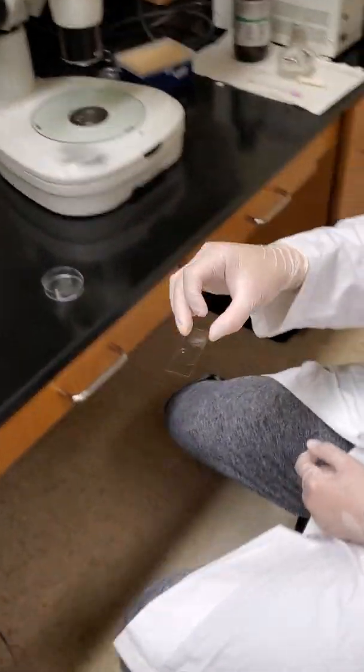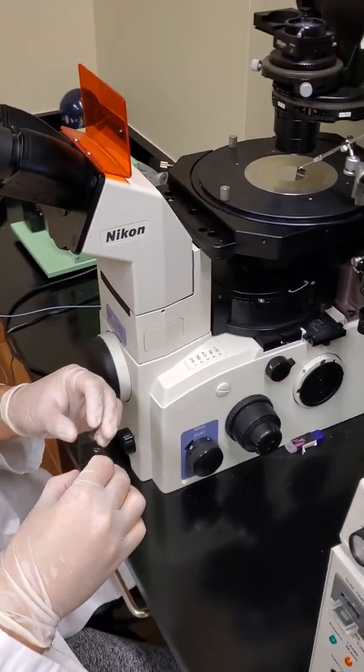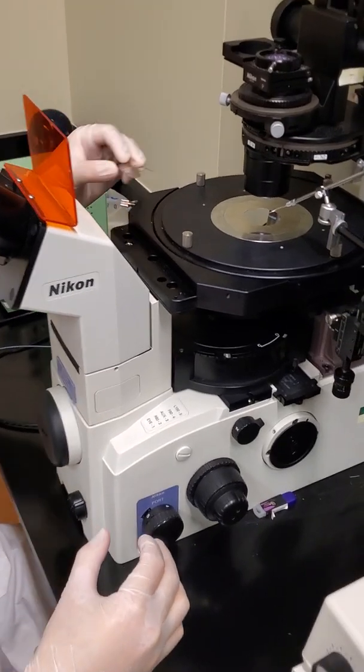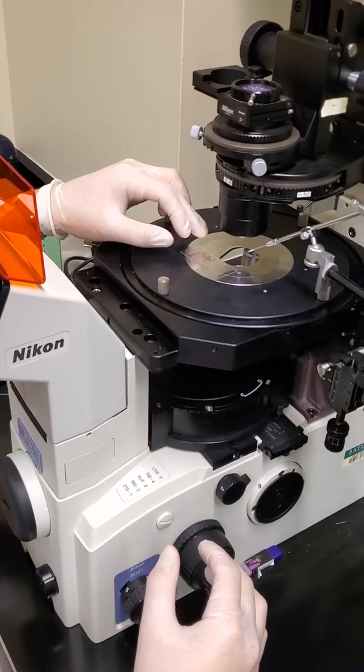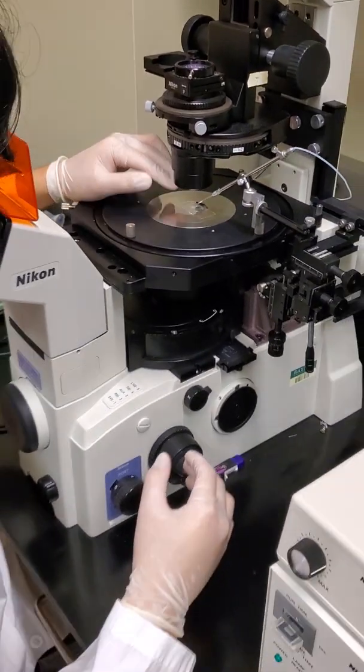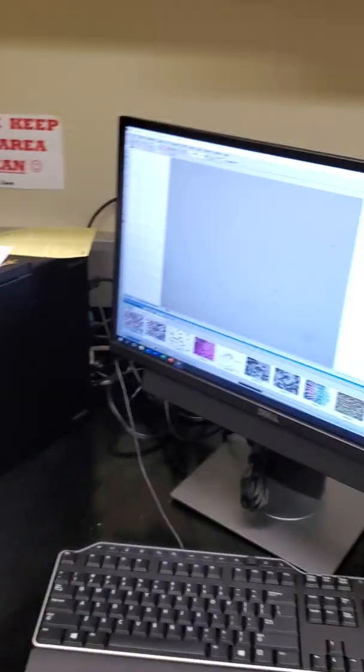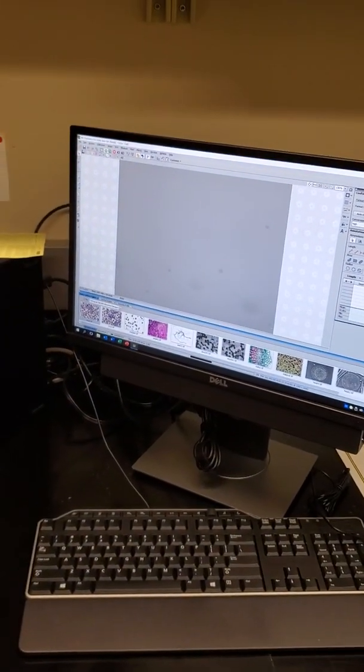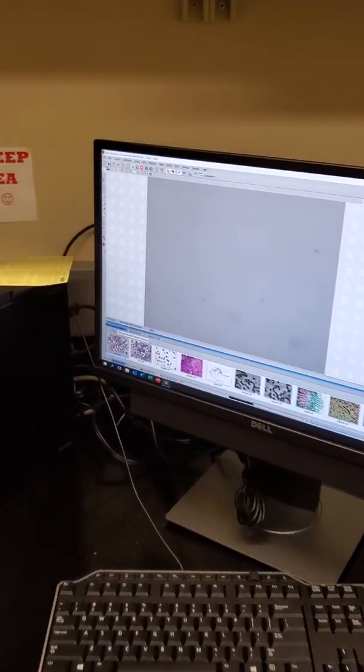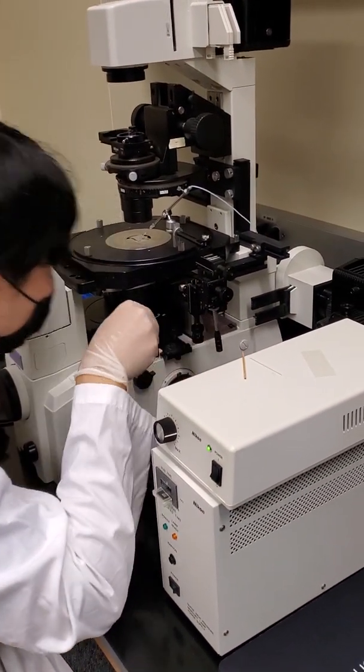Okay, so now that we have our slide ready with the mineral oil and the M9, we can get it over the microscope. And there's still no worms on the slide yet, but we're just using it to focus on the needle first. That way once we do have worms, we can quickly inject them before they dry out. And so we'll be able to see what's going on in the microscope through the monitor once we get closer into focus.